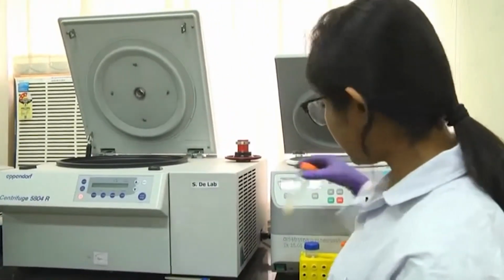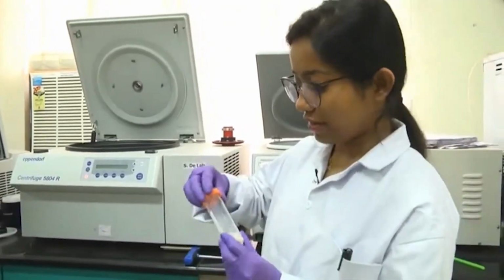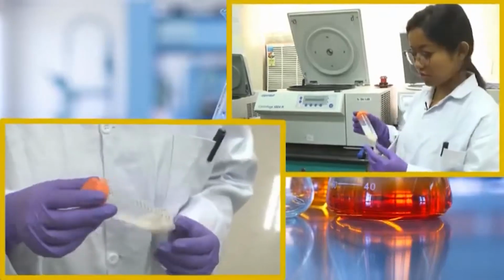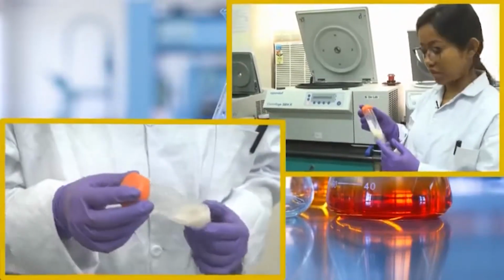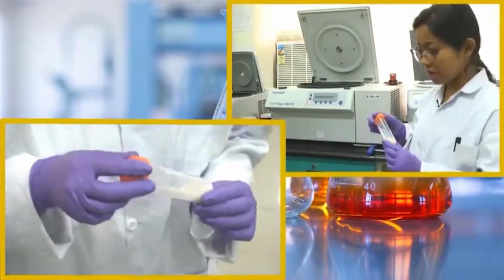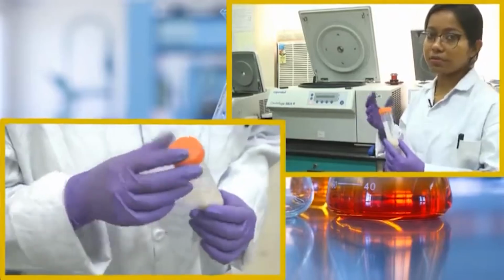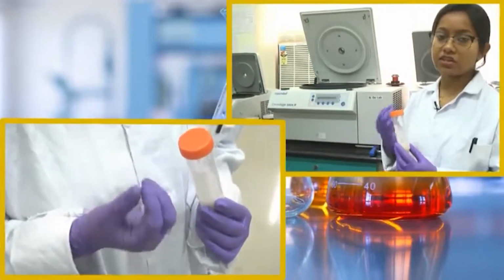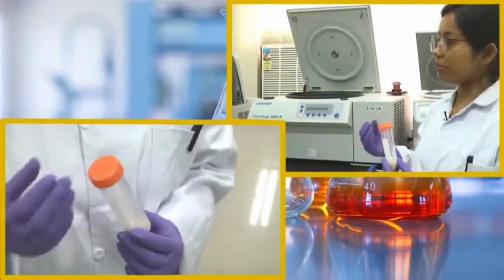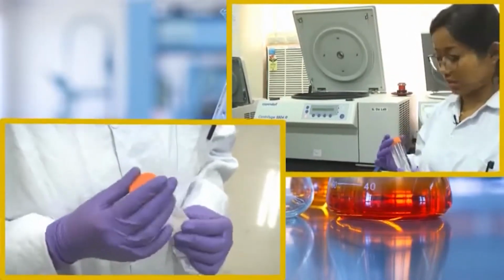So, I have taken the solution from this tube to this particular falcon tube, because we will go for a high speed centrifugation process, and that particular speed is withstood by this centrifugation tube. What it will ensure is that all the big chunks of cell membranes or insoluble fractions will precipitate out from the solution, and if our protein is soluble in the solution, it will come out as a supernatant.